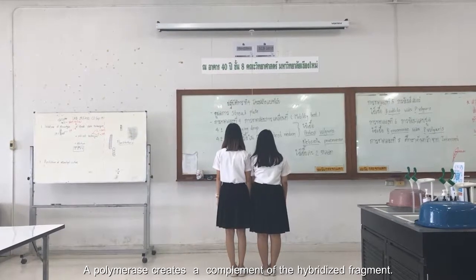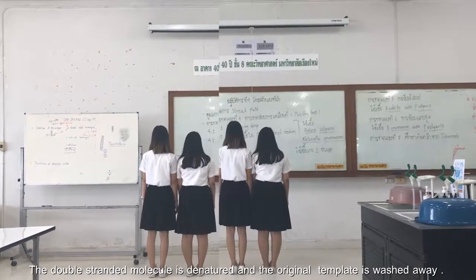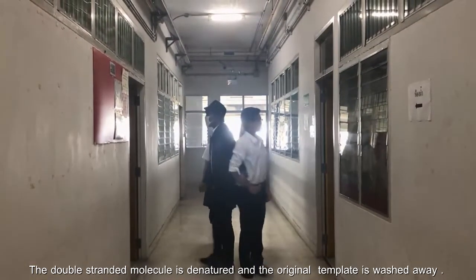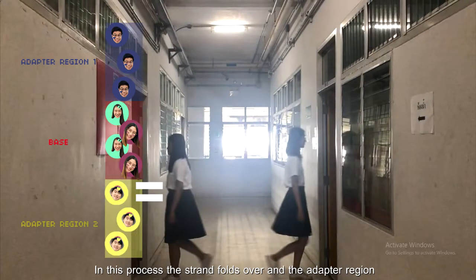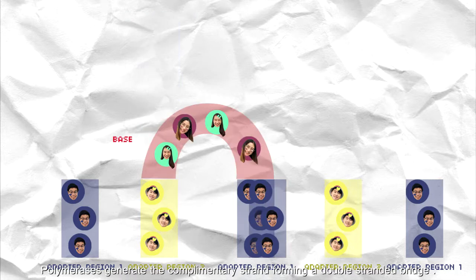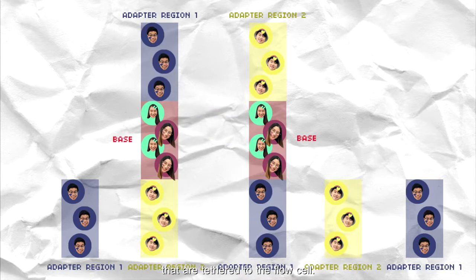A polymerase creates a complement of the hybridized fragment. The double-stranded molecule is denatured and the original template is washed away. The strands are clonally amplified through bridge amplification. In this process, the strand folds over and the adapter region hybridizes to the second type of oligo on the flow cell. Polymerase generates the complementary strand, forming a double-stranded bridge. The bridge is denatured, resulting in two single strands copies of the molecule that are tethered to the flow cell.